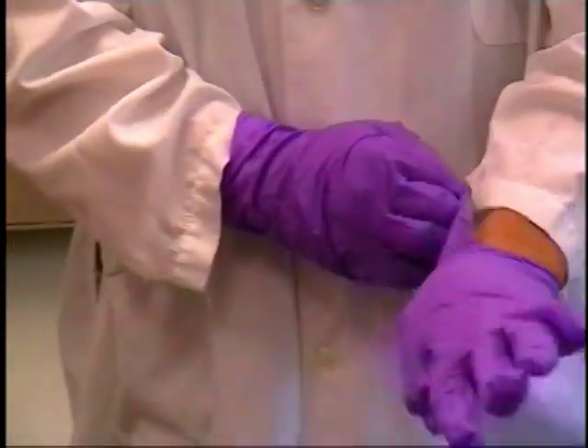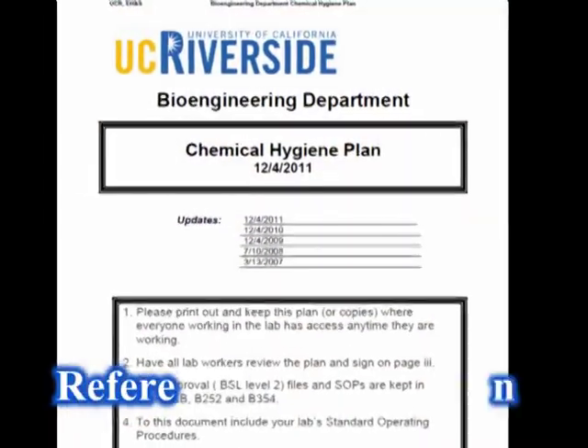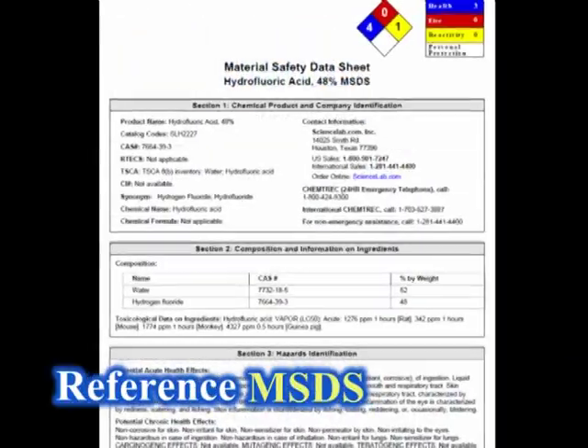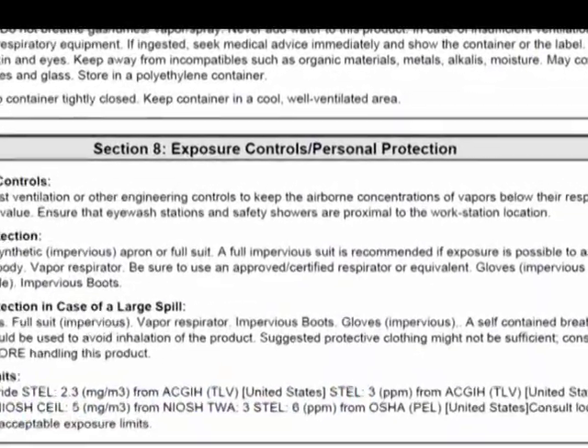First, let's discuss wearing personal protective equipment. PPE should be your last line of defense against hazards. Thus, before using PPE, make sure you have the proper equipment and procedures available first. Refer to the chemical hygiene plan and/or material safety data sheets and other references for recommended spill cleanup methods, materials, and the need for PPE.